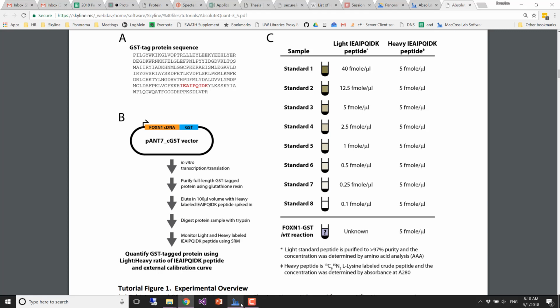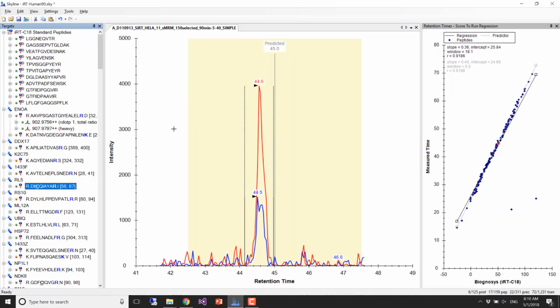in this case we don't. So I still have my IRT stuff up. I don't know if you have anything. If you don't have Skyline up, bring Skyline up. If you have Skyline up, just click New, and we're going to go through creating a completely new document.